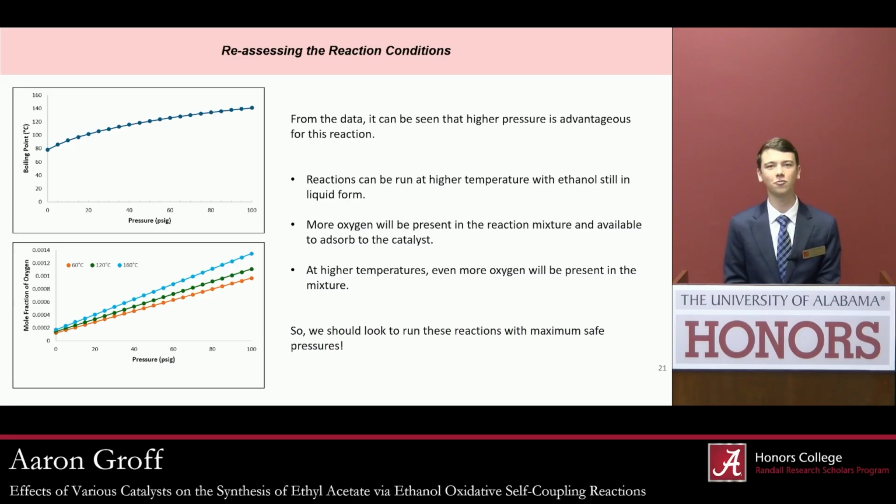Now, higher temperatures would generally not be possible because ethanol has a relatively low boiling point, and we do not want the ethanol to boil. Once it turns into a vapor, you're not going to run the reaction inside of the liquid, and it also can be very dangerous. Vapors expand, and then you could get some sort of rupture of the reaction vessel, and we definitely don't want that. So running at higher pressure allows the ethanol to stay in liquid form even at higher temperatures, which is going to be advantageous for a reaction.